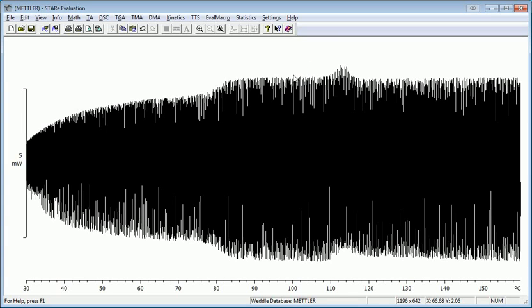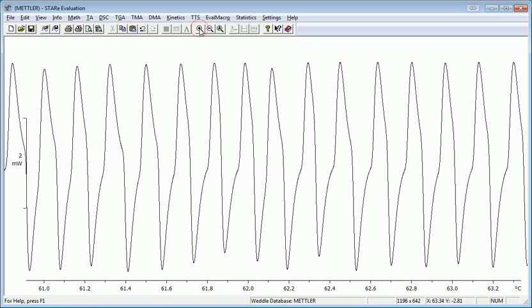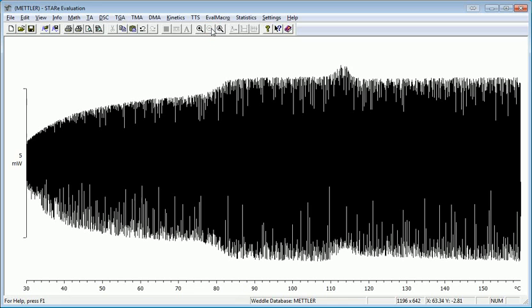You see there's a lot of data. There's actually a lot of oscillations there. They're all compressed on the screen, but if you wanted to, you could draw a small box and hit the zoom button, and you can see the individual pulses that are contained in there. Then I can unzoom and I'm back to seeing all the data.